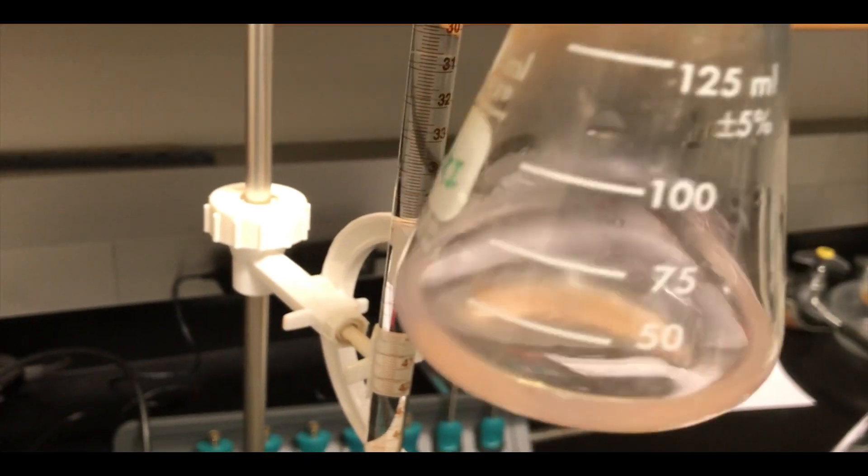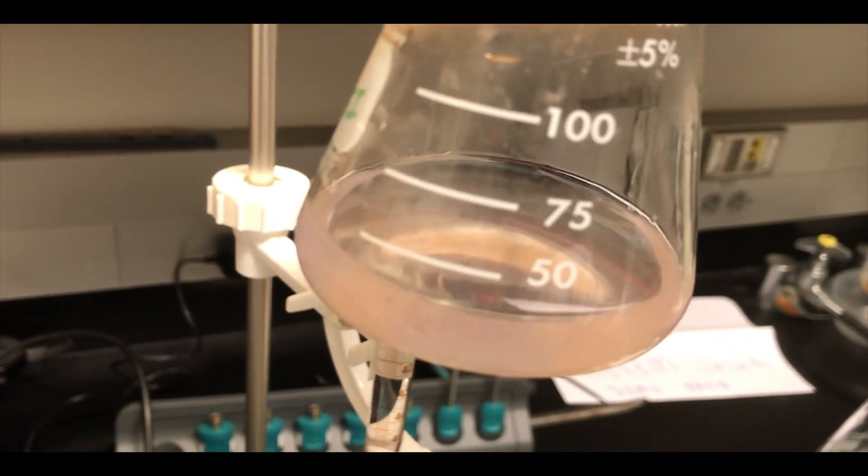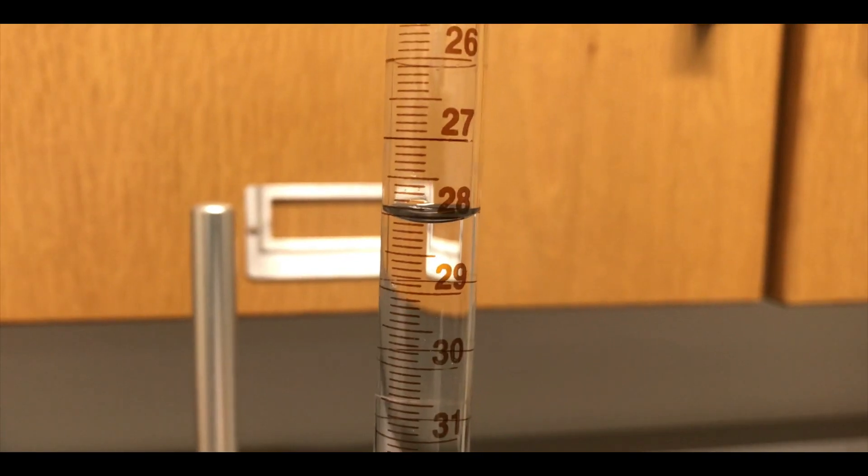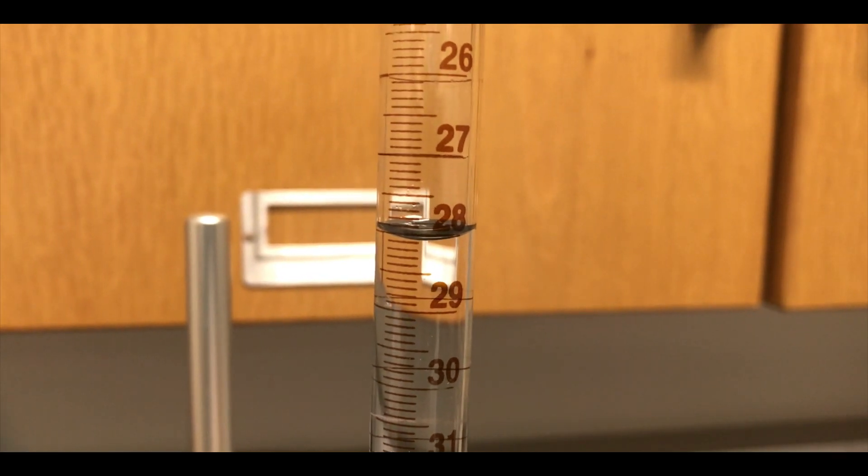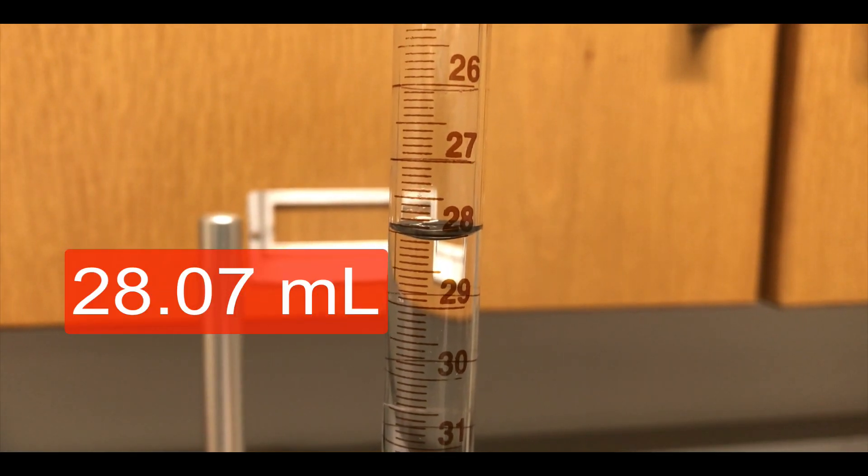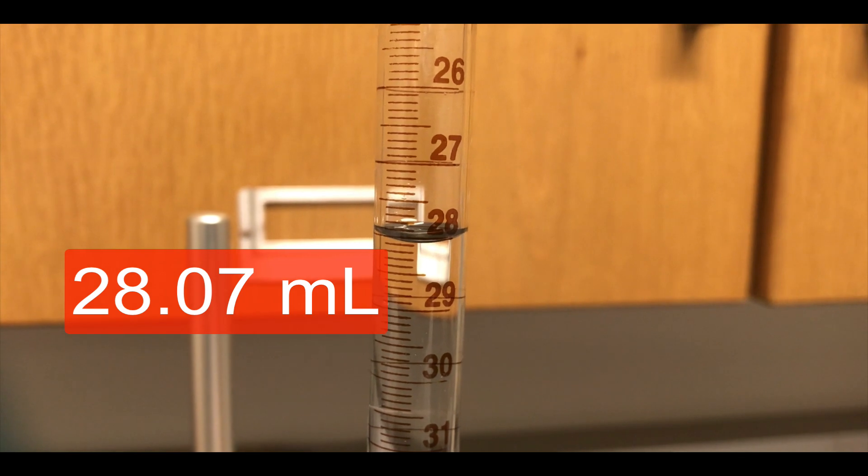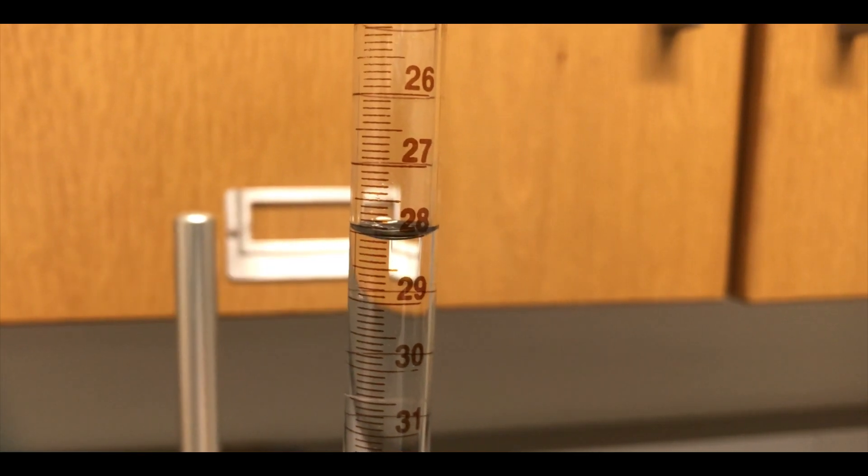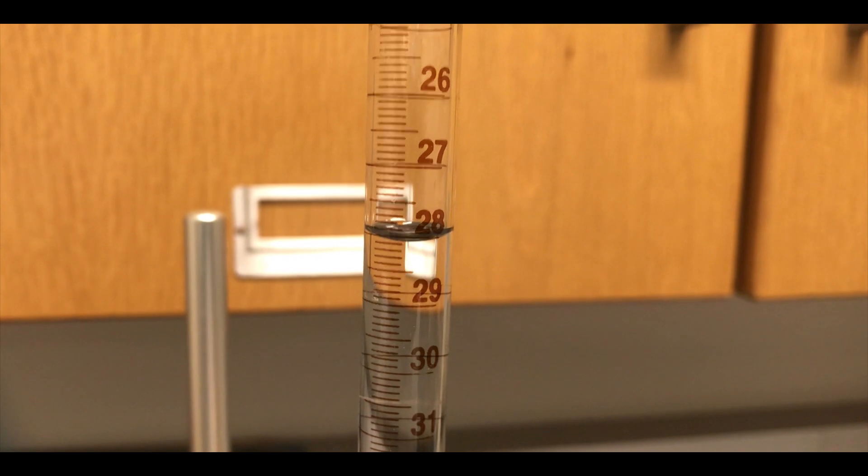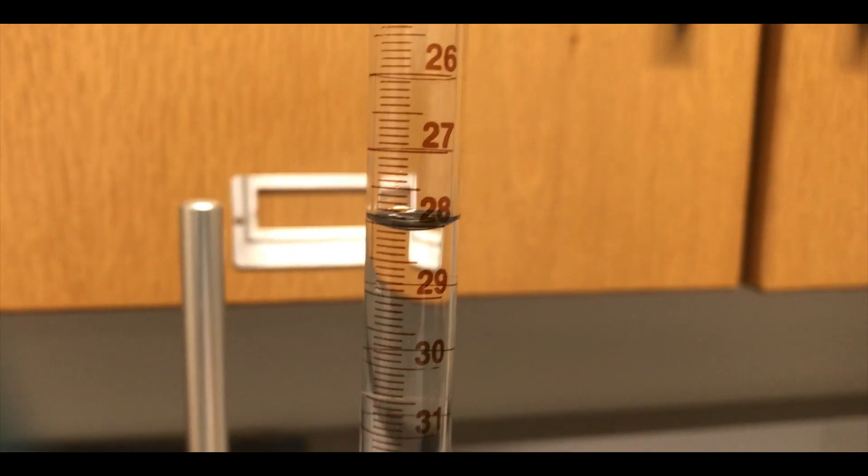And now we're going to take a reading of the final volume to get a sense of how much hydrochloric acid we added. So looking at the bottom of the meniscus there, this looks to be about 28.07 milliliters, I would say. So the difference between that and our initial volume reading tells us how much hydrochloric acid we added.